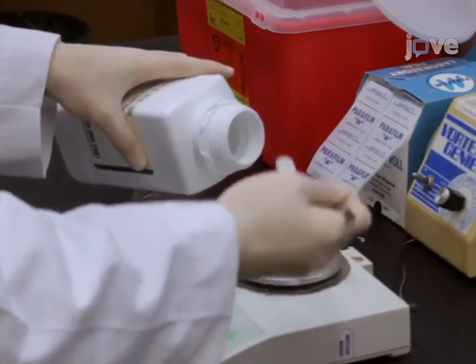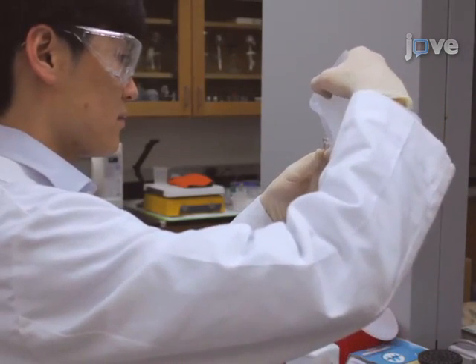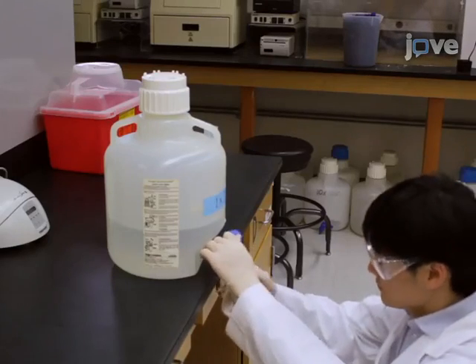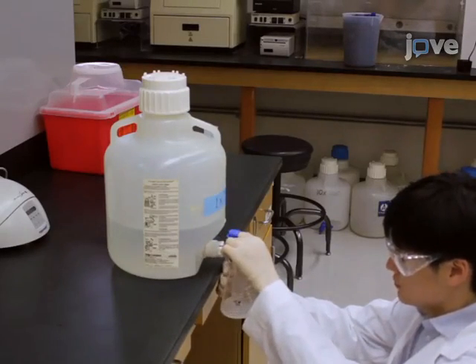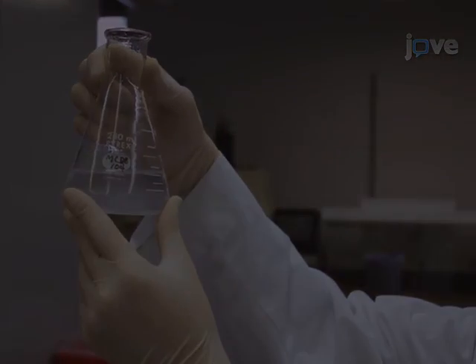To begin the procedure for making a gel, weigh out the appropriate mass of agarose into an Erlenmeyer flask. Add the appropriate volume of running buffer to the flask. The volume of the buffer should not be greater than one third of the capacity of the flask.